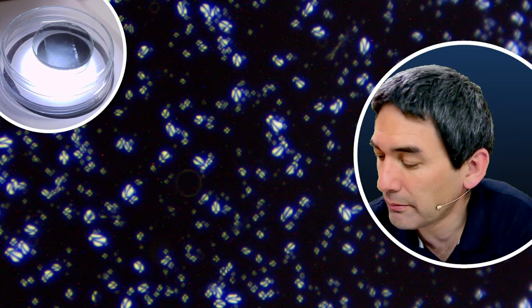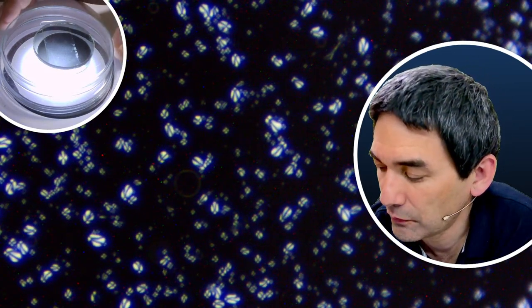Okay, so I can conclude starch grains also work with a stereo microscope. Your magnification is of course not high enough to make them much bigger, but you can actually see them. And of course, you want to make sure that the polarization filters are properly crossed so that the background is dark. So that is something I highly recommend that you try out, because it's kind of easy to do.